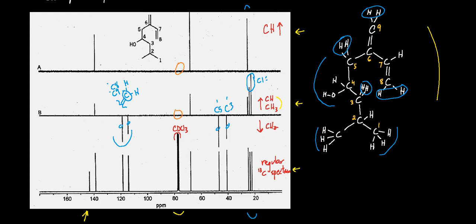Now, what else do we have in the spectrum? Methines, CH, CH, that's 2 of them, 3 of them. Okay, so the methines, let me go to a different color. 1, 2, 3 methines, broadly spaced. This one should be easy to spot since it's so deshielded. That is C7, right? Because it's an alkene methine.